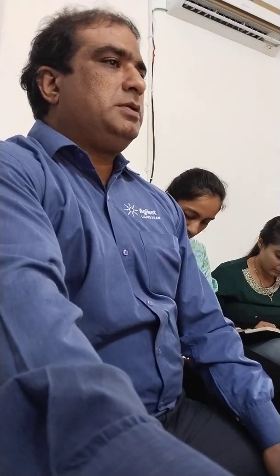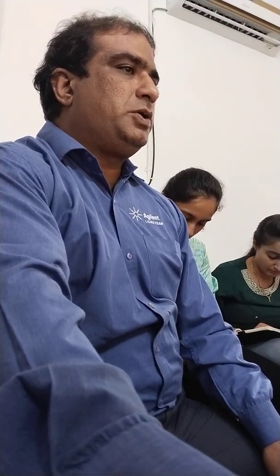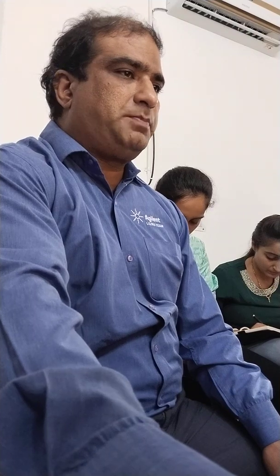Now in auto MSMS, we know 922.0098 is our precursor mass, the reference mass. We need to exclude that, correct? Second, 121 is our reference mass. We have selected here 121 point. So these are reference masses.